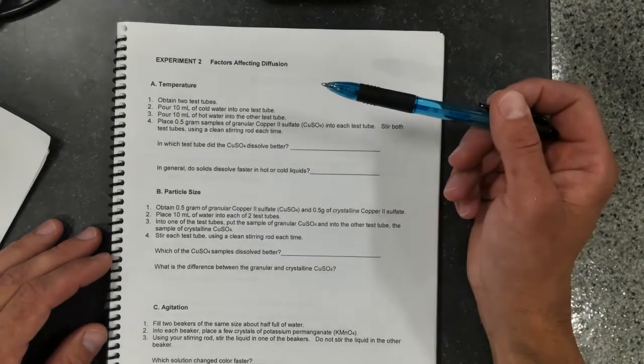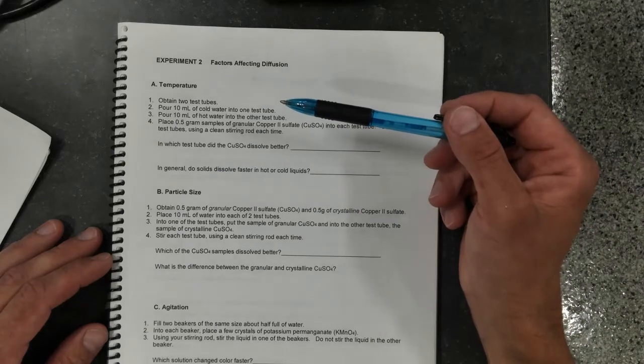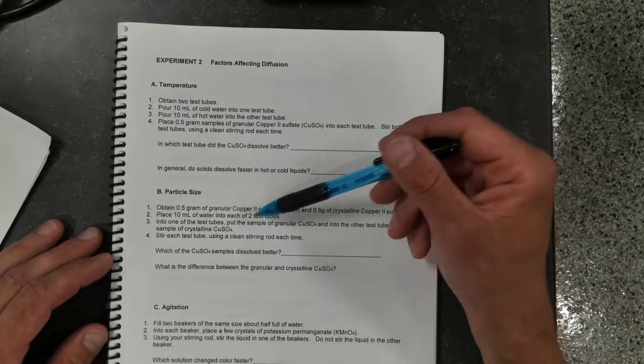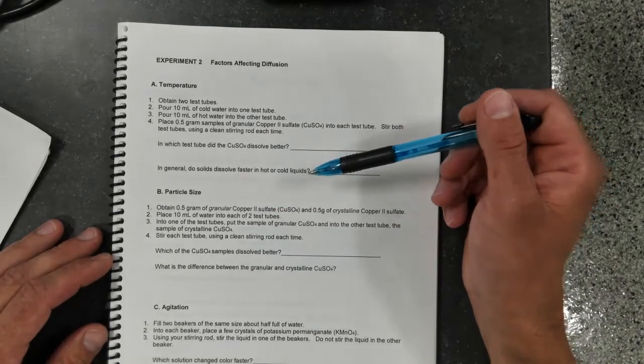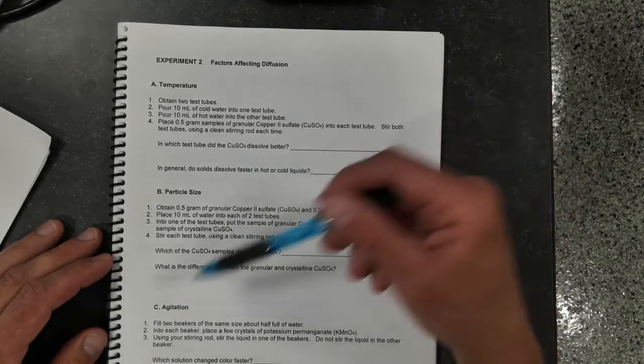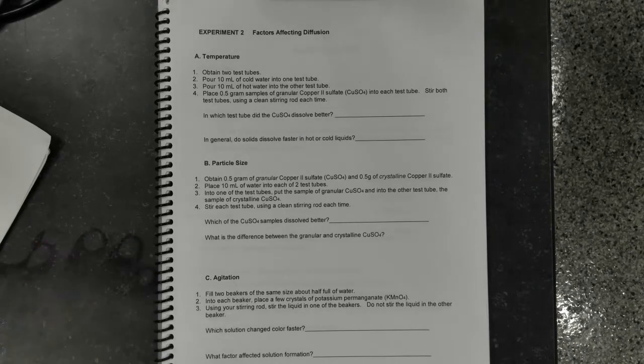We're going to see in which one the process of dissolution goes faster. In the second comparison of 2 test tubes, we're going to compare the particle size. We have granular versus crystalline copper sulfate, and we're going to look at which one dissolves faster. And finally, for agitation, we're going to have 2 beakers the same size, and we're going to drop a few crystals of potassium permanganate and then see if stirring affects the process of dissolution.